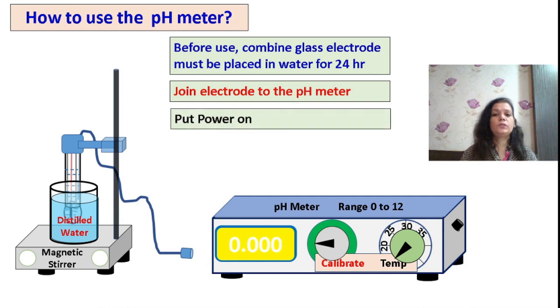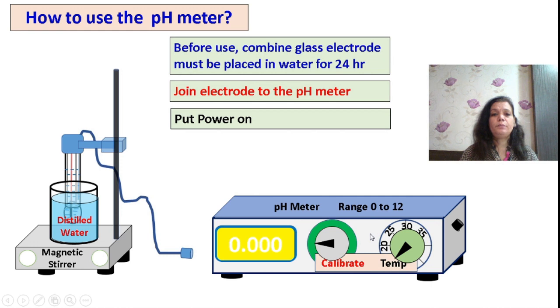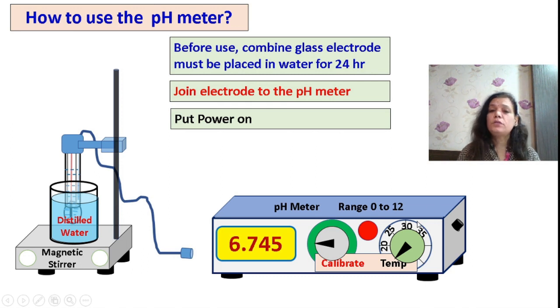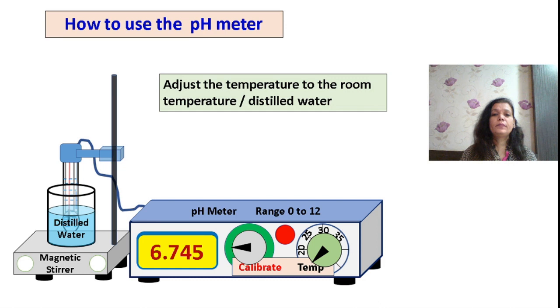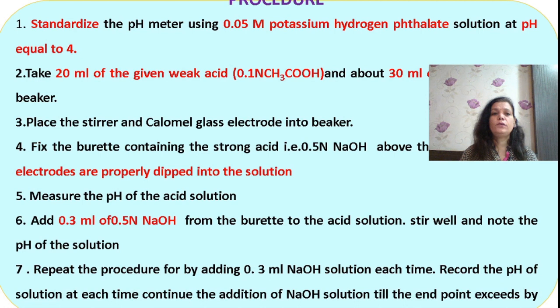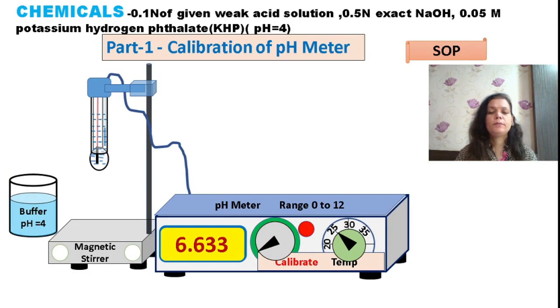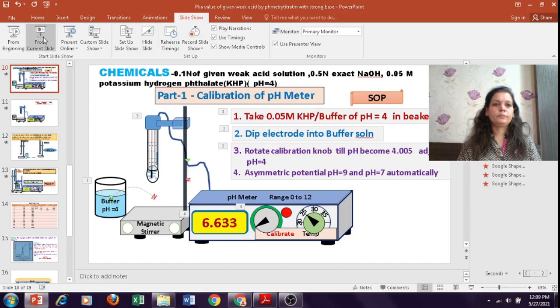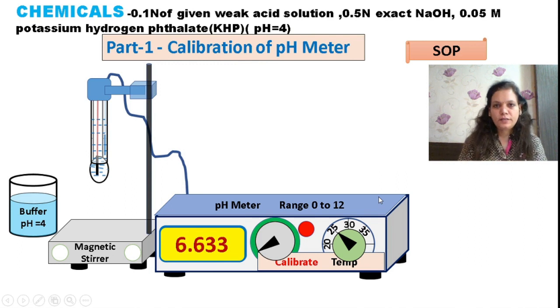Switch on the instrument and make it power on — it will show a red indicator to confirm the instrument is on. Before starting any instrumental analysis, you need to standardize the apparatus to confirm the readings obtained are accurate and precise for your experiment.